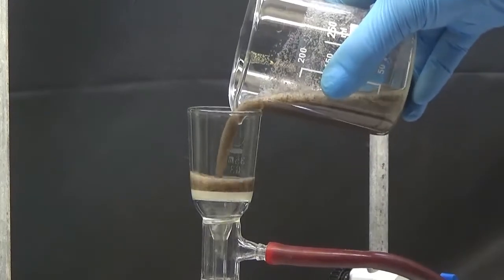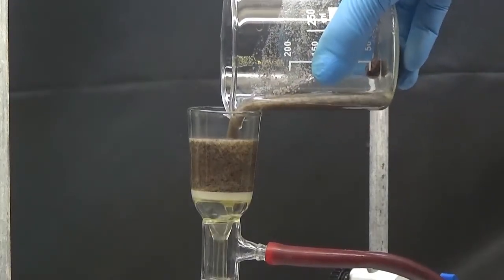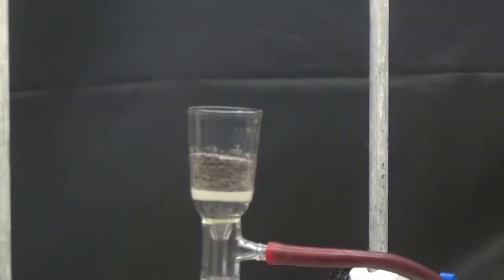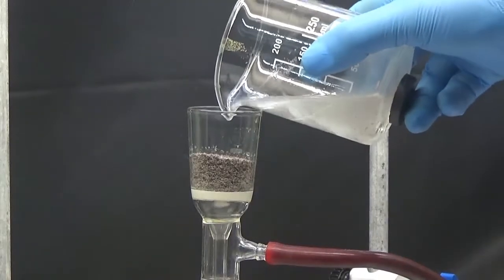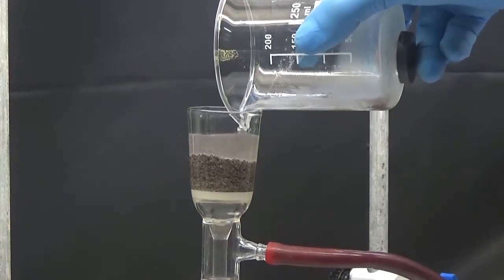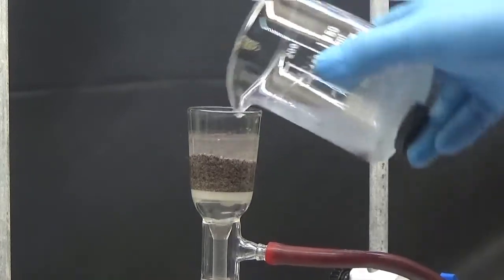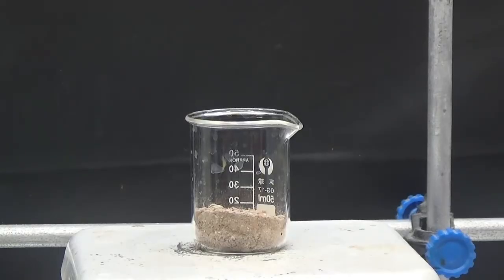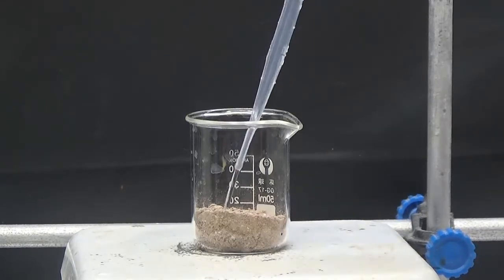Collect the solid by suction filtering. Clean with cold water twice. Dry the solid at 60 degrees celsius in an oven.